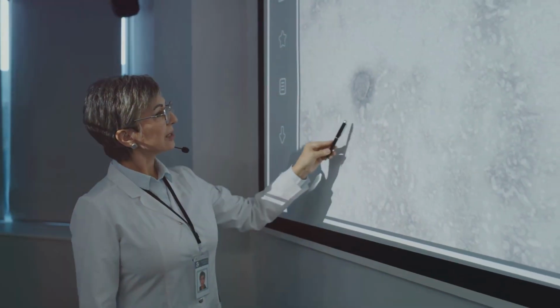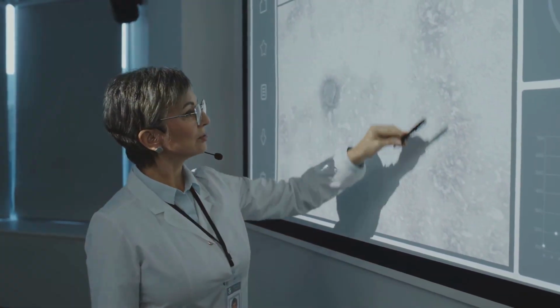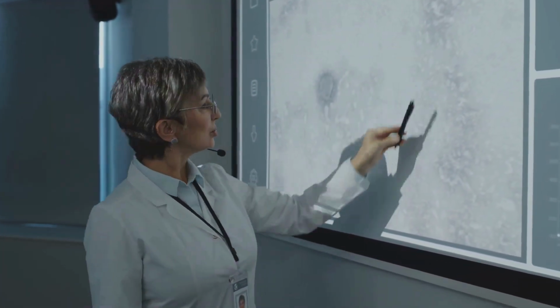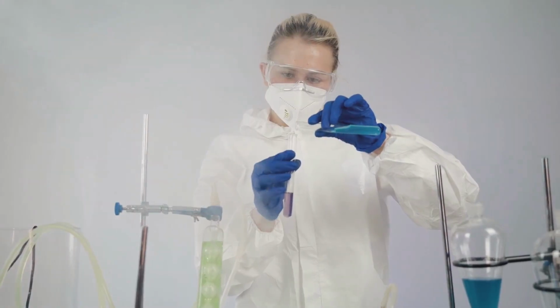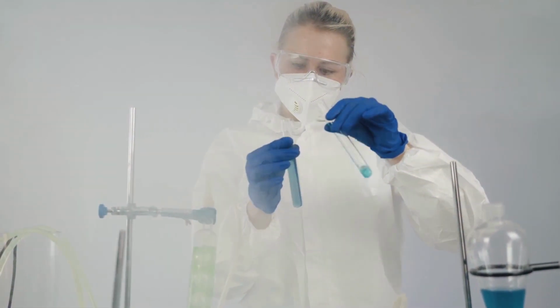In this guide, we'll break down a clear, 5-step framework to help you pick the perfect detergent for your specific needs and experimental goals. You'll learn how to match your detergent to your goal, calculate the right concentrations, design the optimal buffer, and validate your results with confidence.